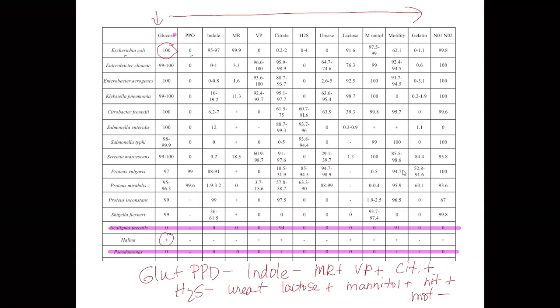Okay, now PPD is negative. So that means that I'm going to cross out the PPDs that are positive. So I'm crossing out the opposite, right? So I'm going to cross out this one, and this one. I tend to put a line through everything so that I know, as I get further out of here, what I've actually crossed out.